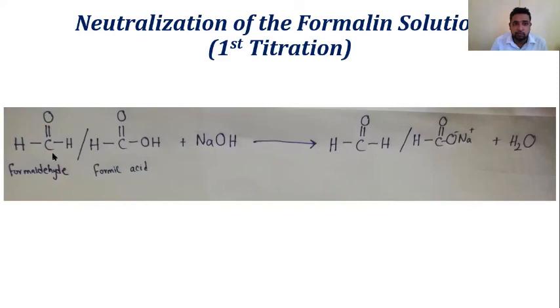carcinogen for humans. Thereby, when we are handling formaldehyde, you must be very careful, and when you are doing this experiment, you have to wear a mask. As well as when you are handling formaldehyde, always keep it closed. When you put it into a beaker, you have to at least close it using a watch glass. Inhaling can cause harm to you, as it is a known carcinogen for humans. Thereby you have to be very careful. I explained that in the video also.